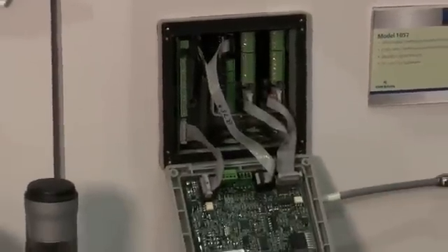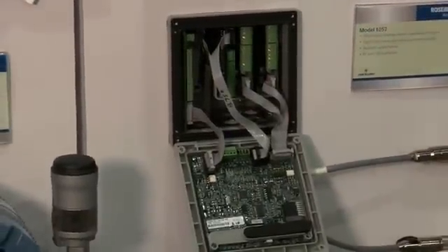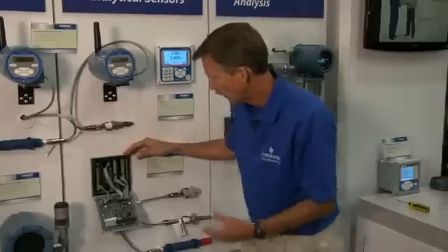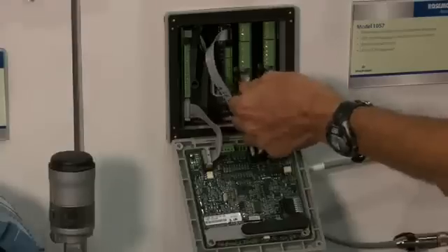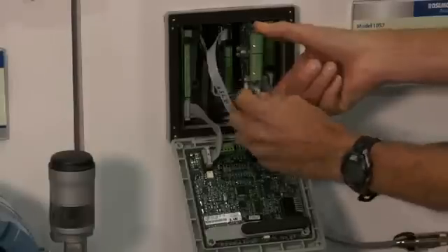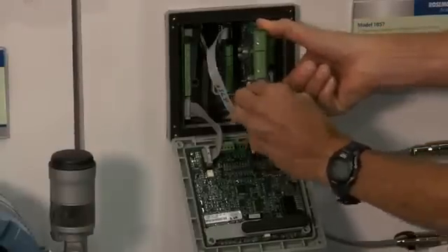The third feature I'll talk about is the ease of installation, both mechanically and electrically, with the Model 1057. Using modular architecture for removable connectors and slide-out signal boards, this is quite easy. Here is the inner workings of the Model 1057, and here you can see up to three signal input boards can be installed. To install a new sensor input board, simply remove the modular connector on the signal board, remove the signal board itself, and then install a new signal board.